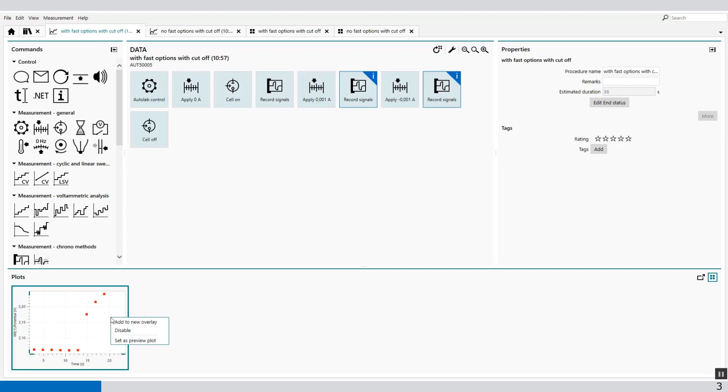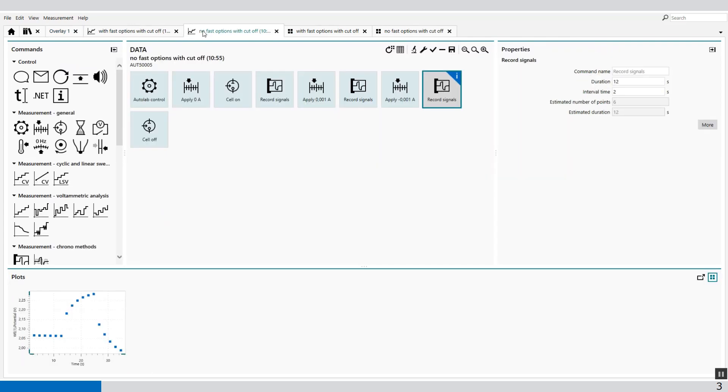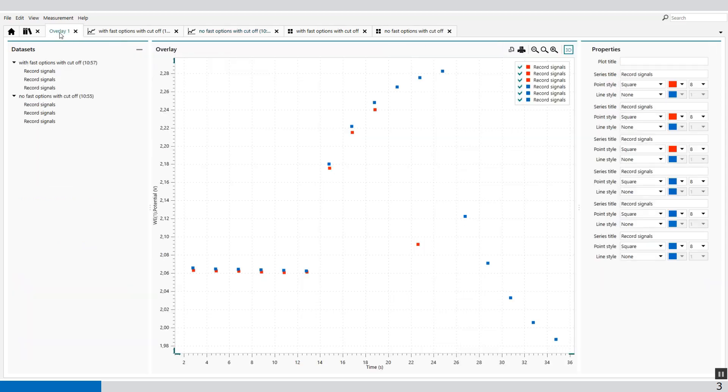so we add to a new overlay this measurement and this measurement, you will see the difference in how fast the cutoff conditions are measured.